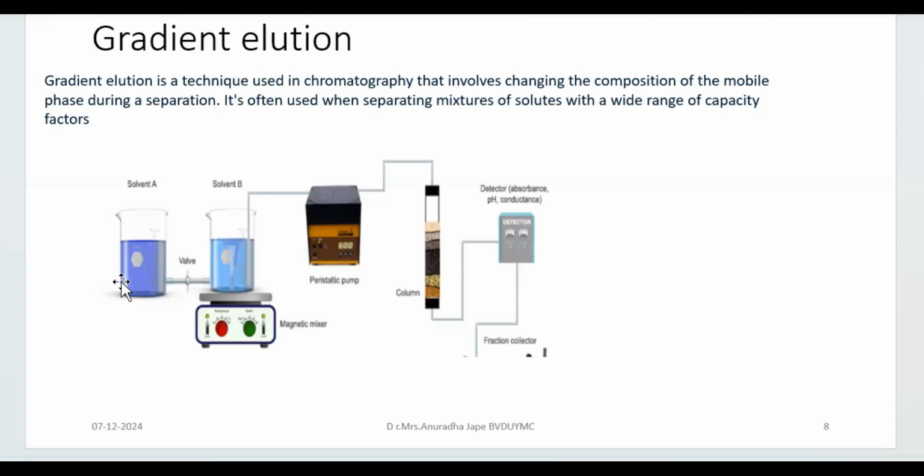So a difference between the level of the liquid in the reservoir and that in the column, and the level at the outlet of the column. All these are to be taken into consideration, and you can set the flow rate. So generally, a simple open reservoir for the column is not sufficient. If you want to set the rate, you have to have a reservoir which can be operated with the help of a pressure pump, right?